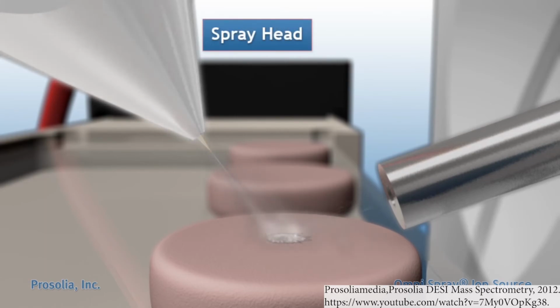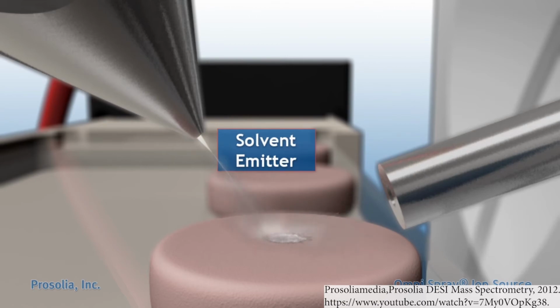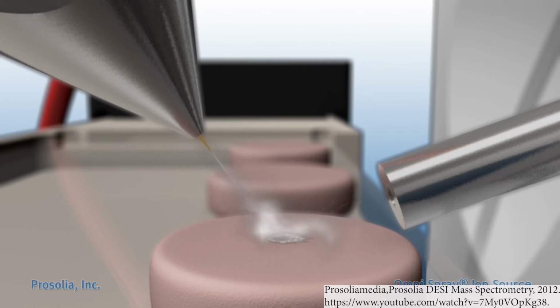The spray head is, you're going to crank up the gas, so like I said, it's like a pressure washer, and the stuff bounces off the surface. Here they're using a pill into the inlet of the mass spectrometer, but it's going to blow particles in the mass spectrometer, but also the solvent that it's blowing from the electrospray is ionized solvent.